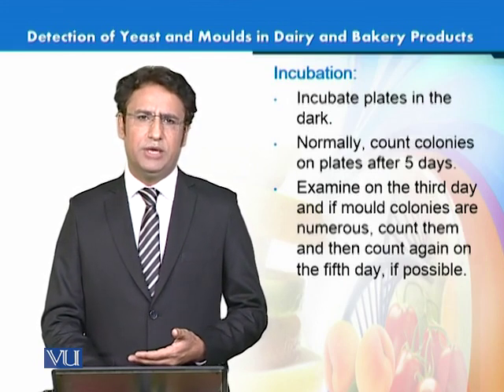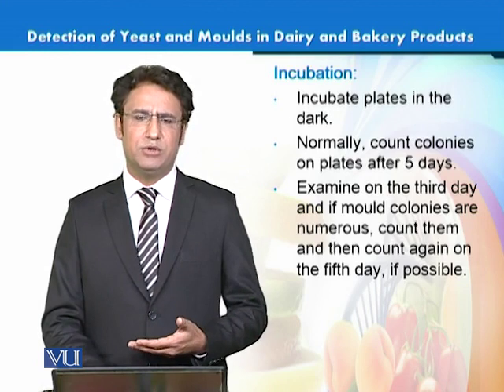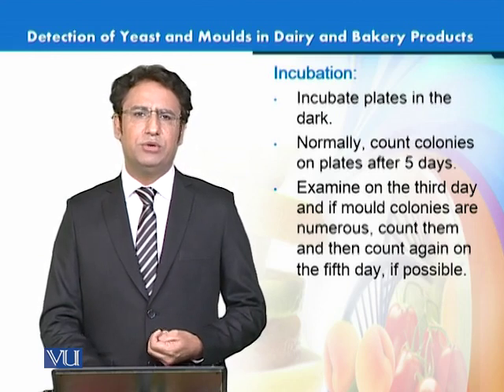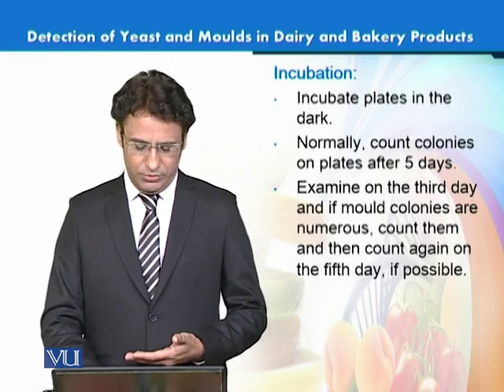or fifth day. They may be counted on the third day if we see that there are a large number of colonies. If there are higher numbers of colonies, then the colonies can be counted on day 3. But in case they don't show up on day 3, then these colonies can be counted on day 5.